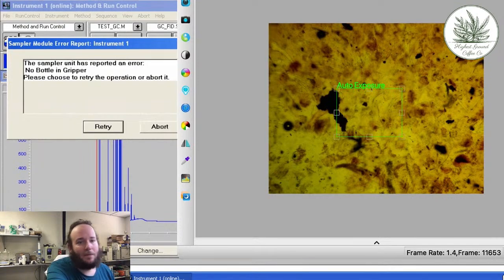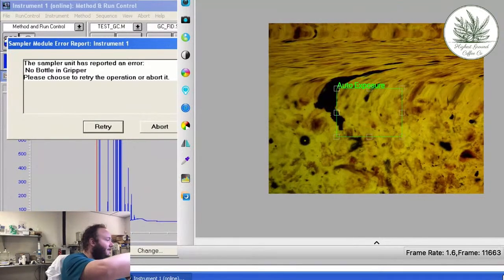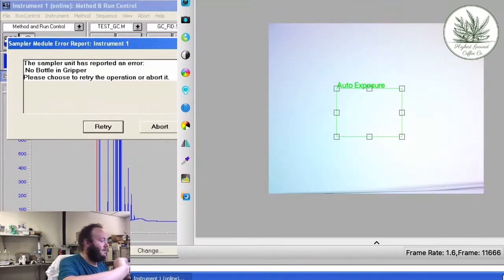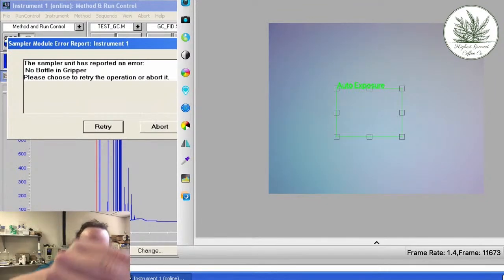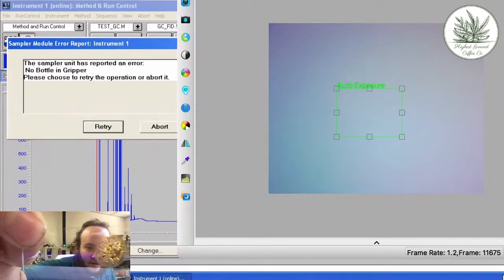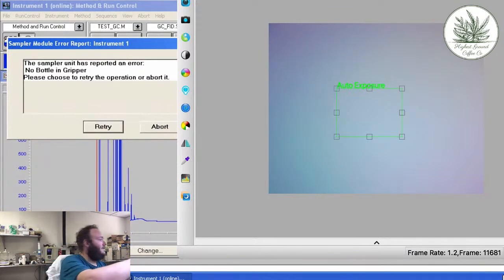I was thinking maybe I'll take the top slide off so it's not pressing down. That might give us something more interesting to look at. In fact, I don't know if you can see that now on my camera here. So that's what it looks like instead of being pressed onto two slides.